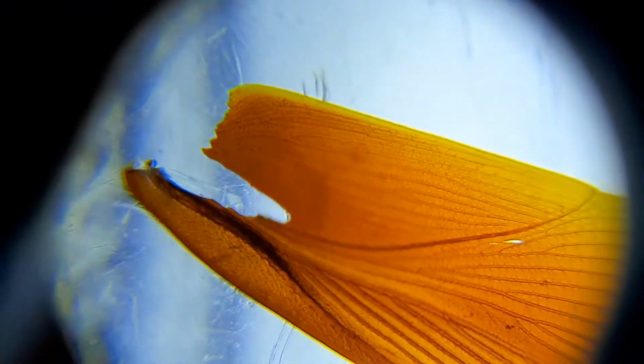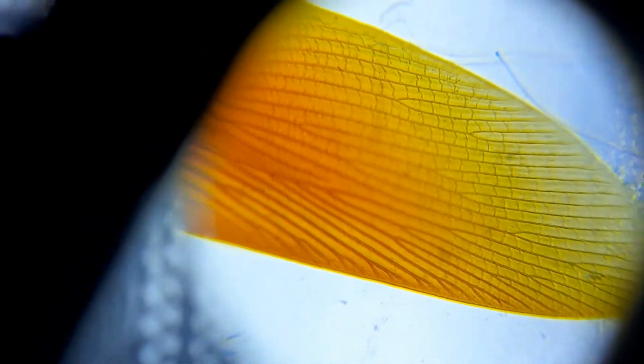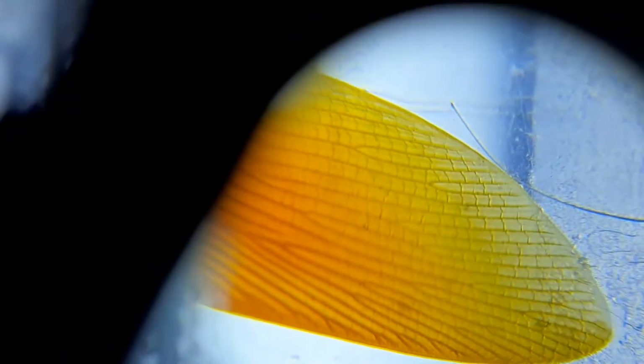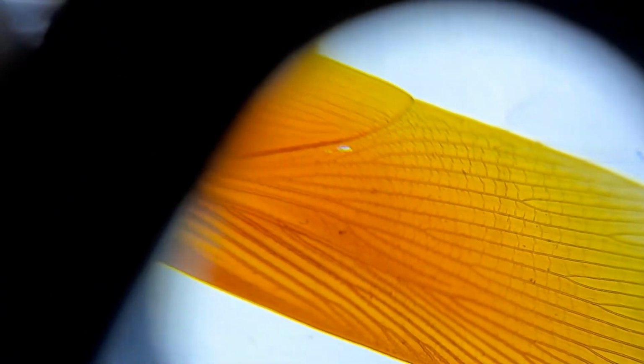So it's sometimes tricky to see this directly under the Foldscope. So we can take endless notes looking at these structures, and also we can draw them and make a collection of art of the wings. Actually, that is a cool title for a notebook.